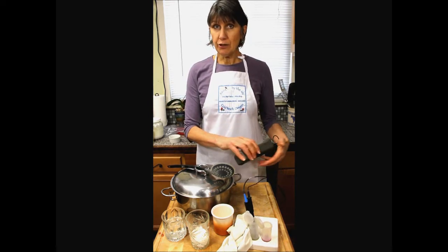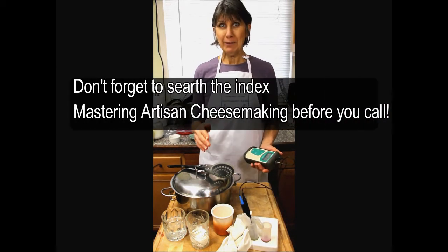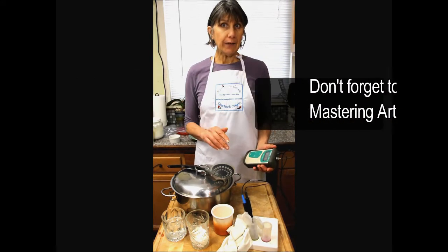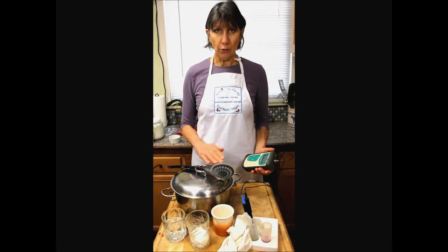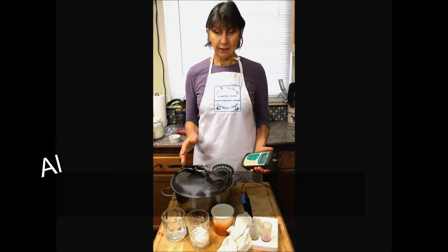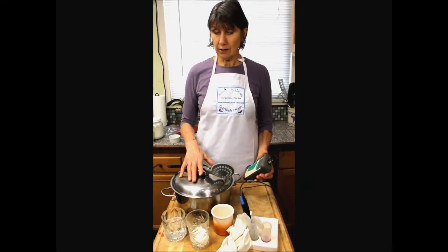If you're trying to troubleshoot and you call me, the first thing I'm going to ask you is probably what was the pH, or what was the start pH, or something to do with that. pH is a measurement of the free acid in the cheese and the milk. It's the control of that acid production during the whole process of cheese making that will make or break your cheese. Today, we're going to check some milk pHs, going to make some curd and check it along the way.